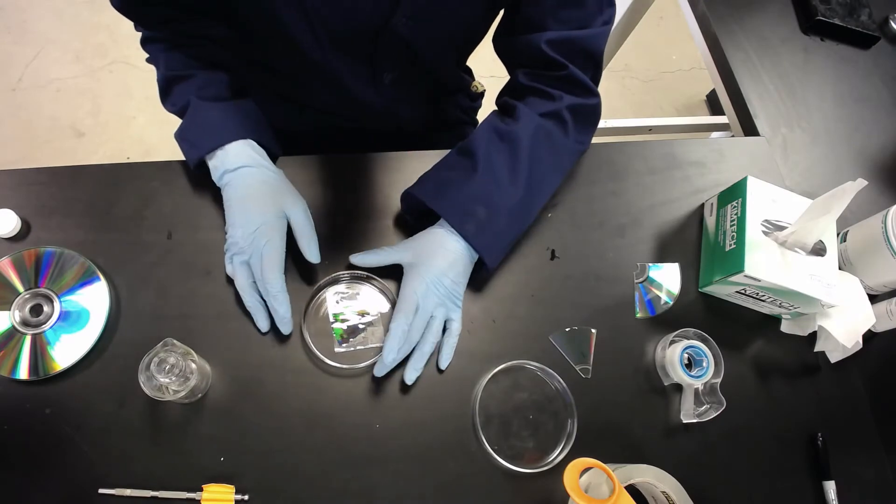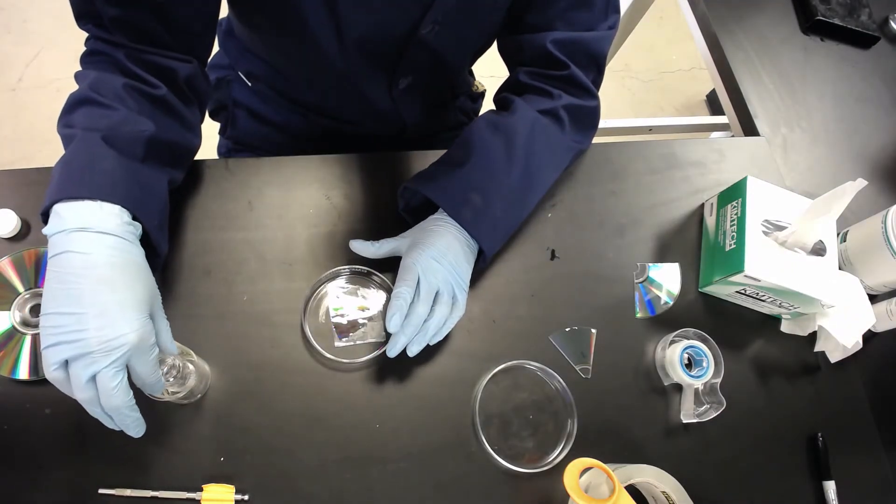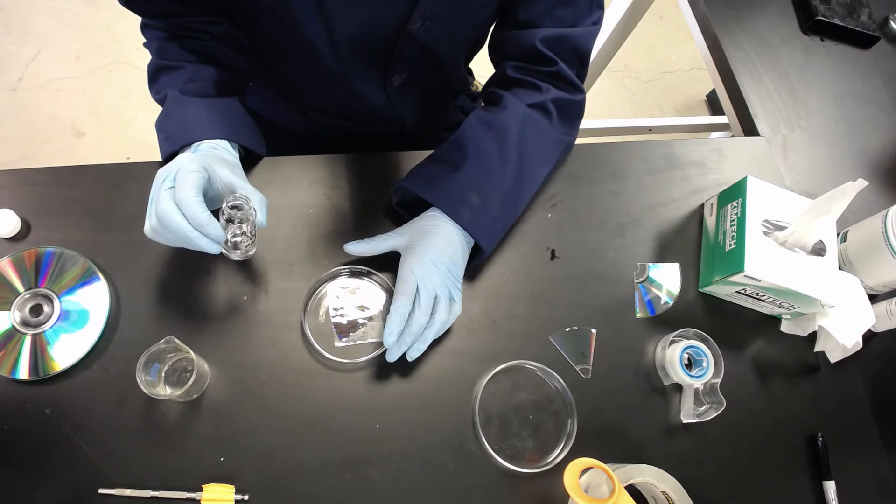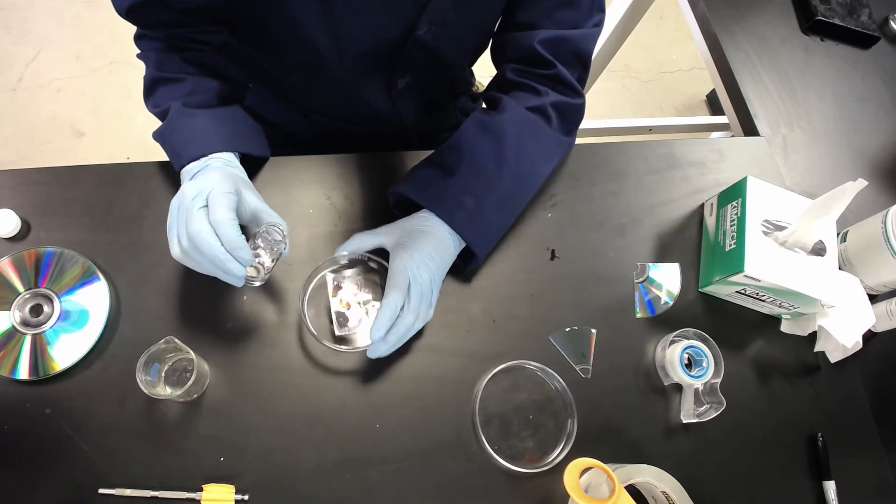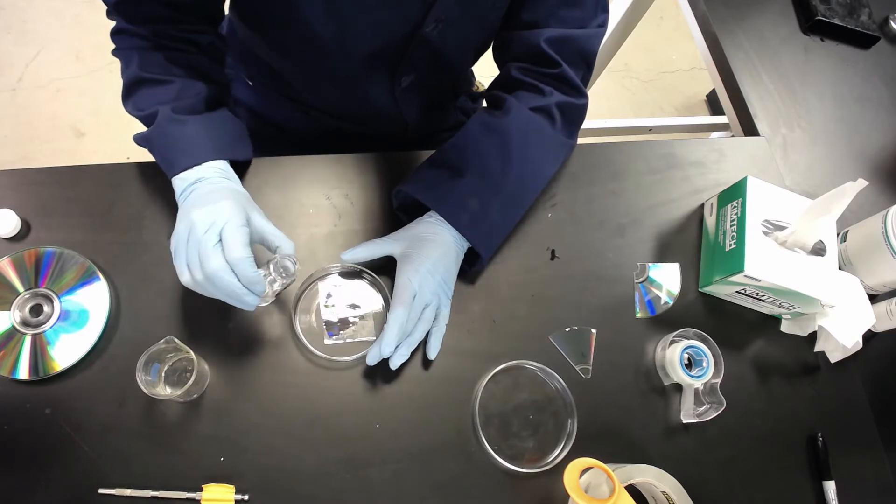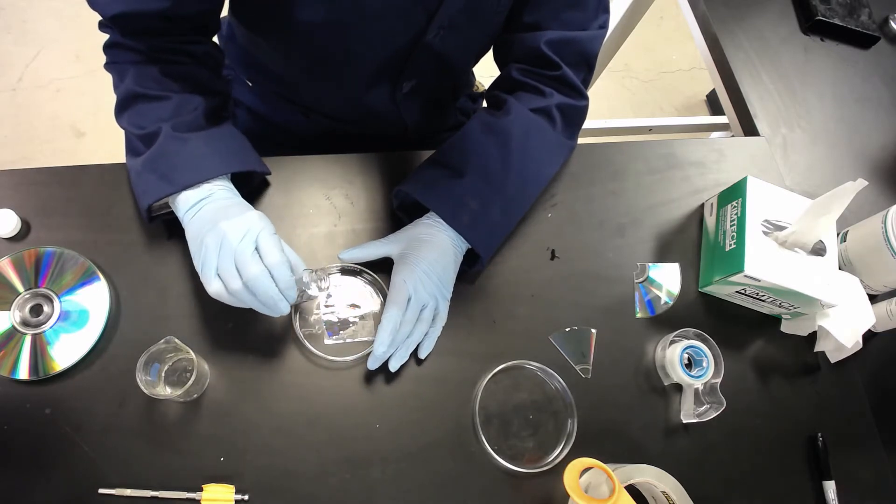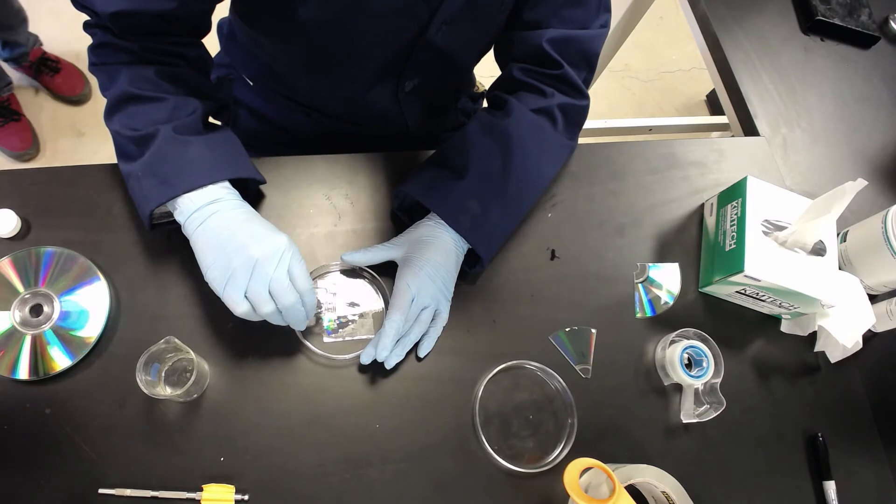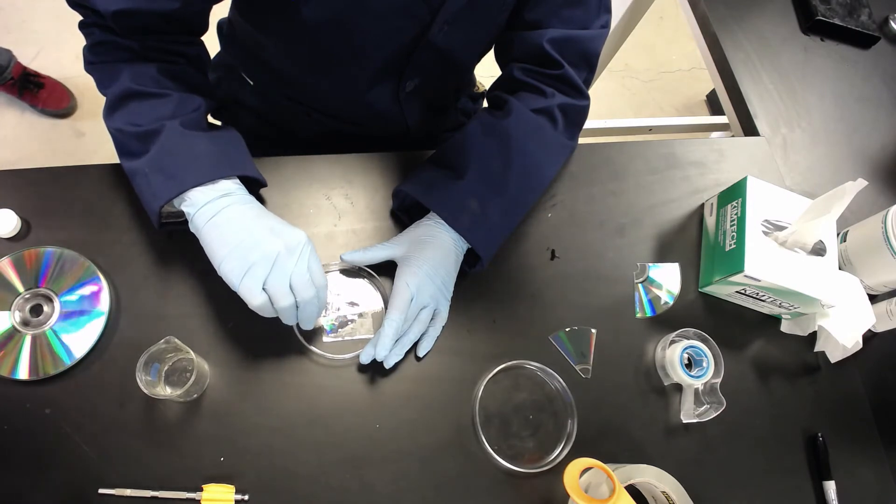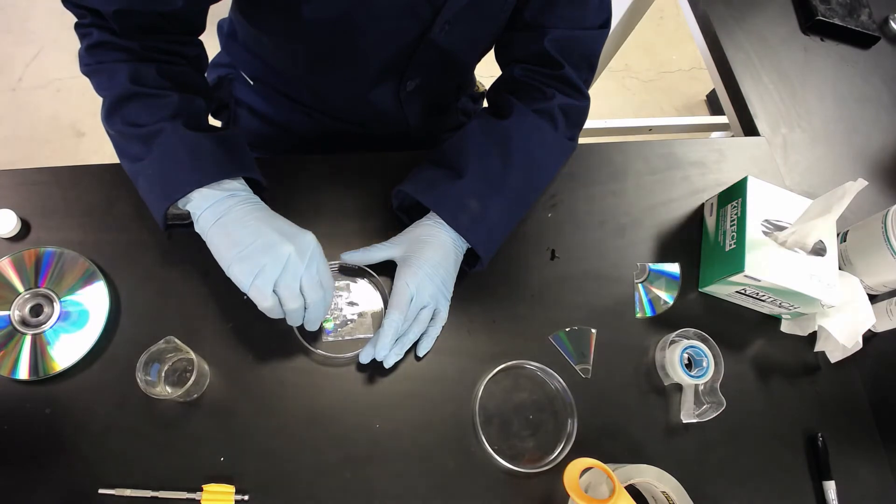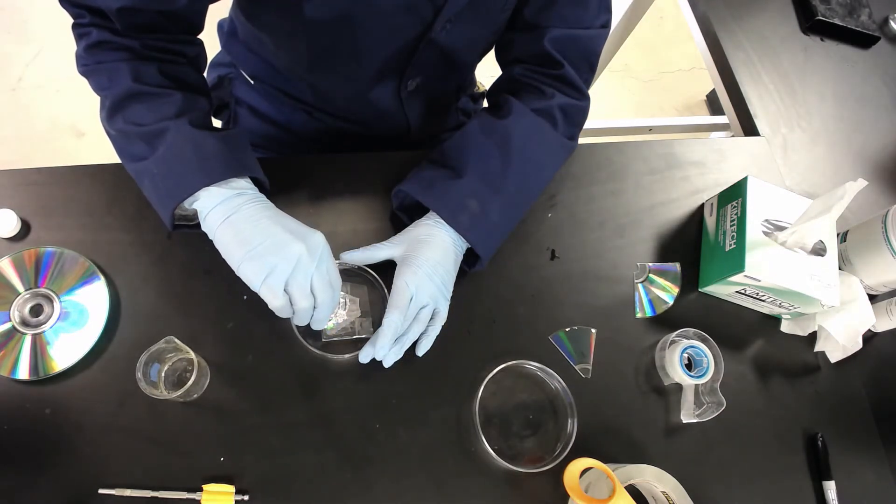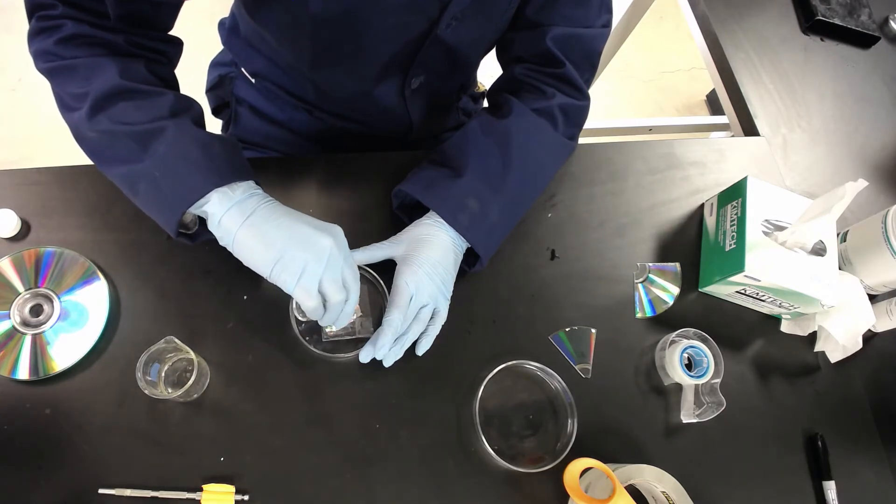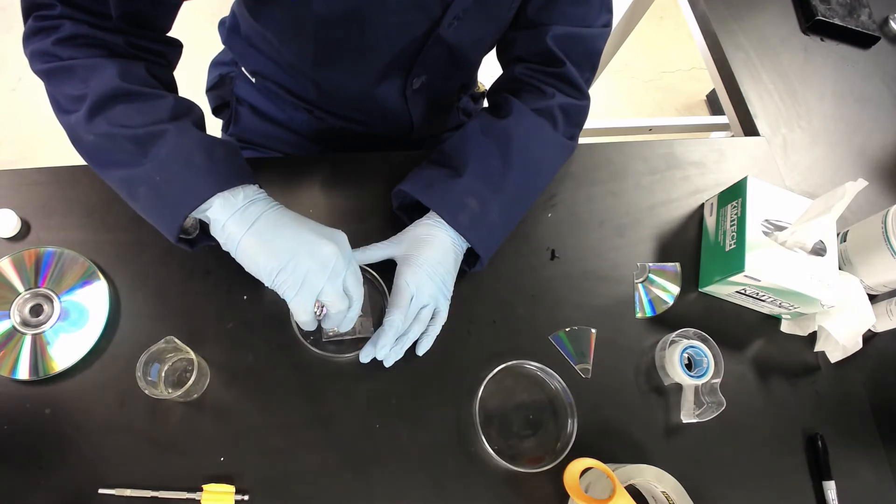Okay, moving right along. We are now going on to the last step here, where we're going to take our PDMS that we just took out of the vac oven and we're going to pour it into our master. We're going to do our best to minimize bubbles, so I'm going to pour it all in one go. Here it comes.